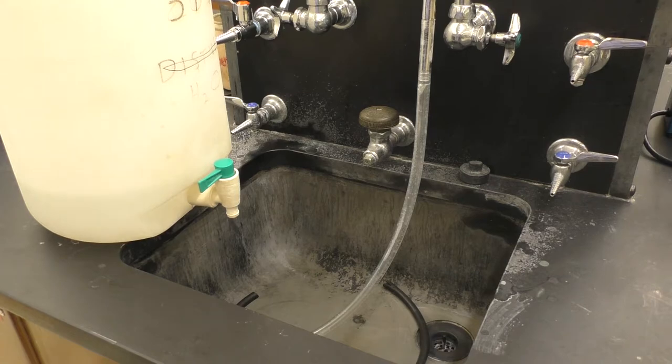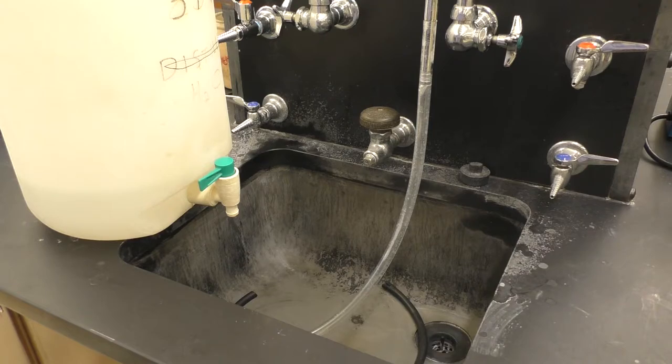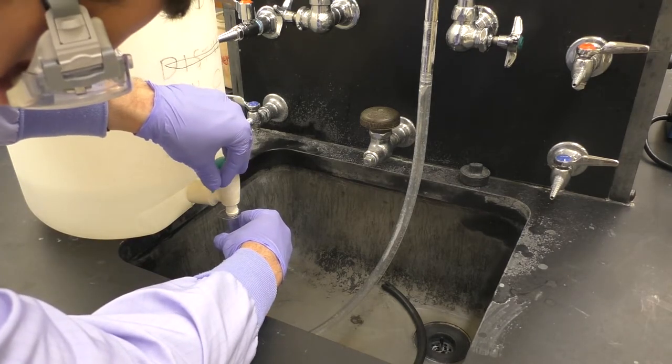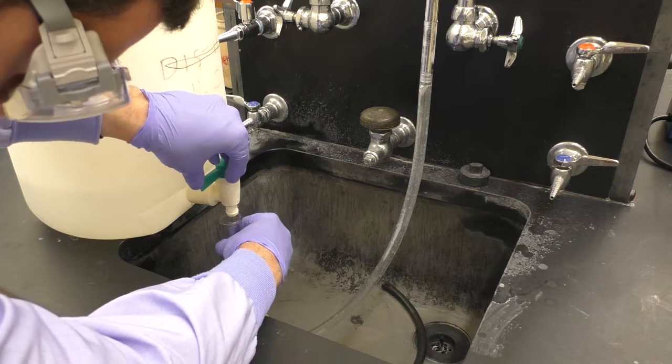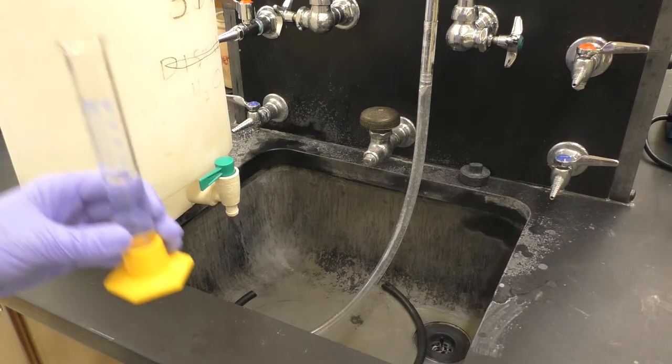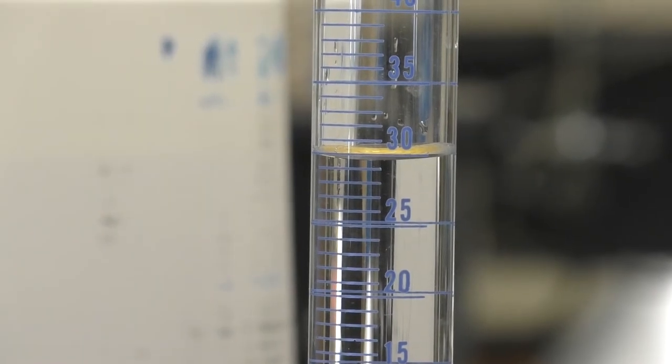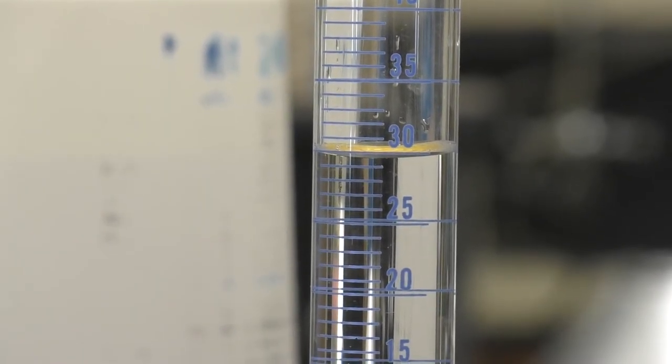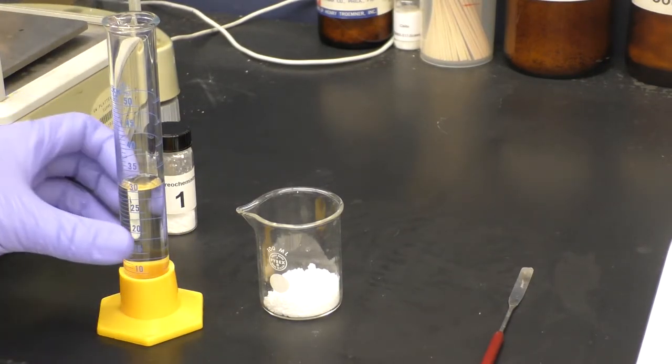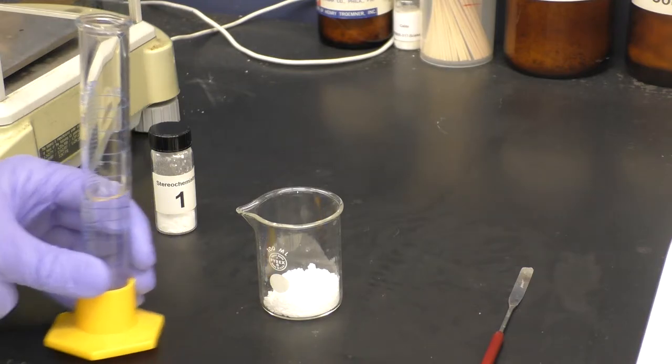Next, we come over to the distilled water spigot and take and measure 30 milliliters of distilled water. We can now take our 30 milliliters of water and mix it into the three grams of unknown and create our homogeneous solution.